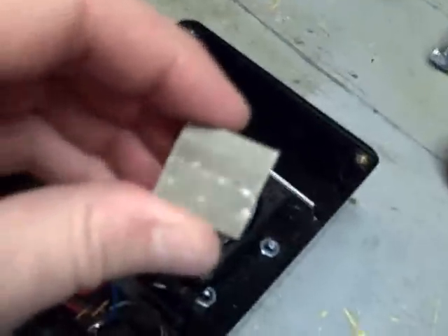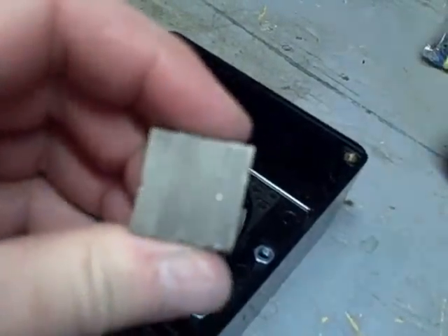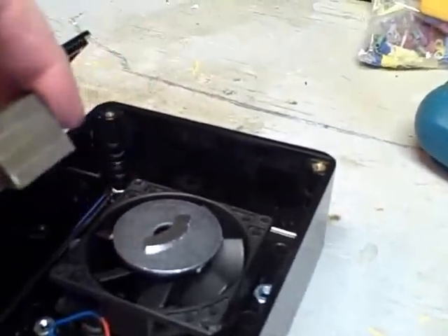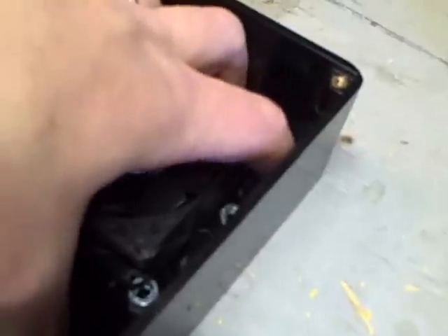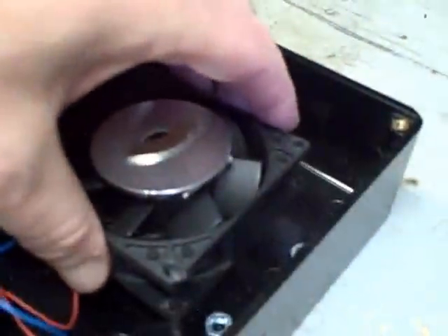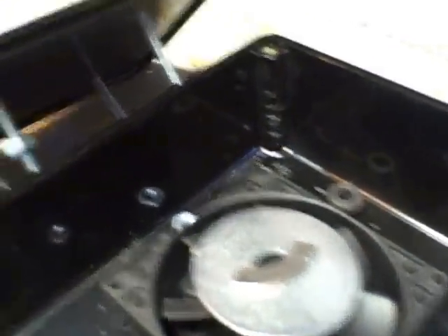I scored some rare earth magnets from work — there are four of them and they are super duper strong. I was going to end up using one on each side if the hard drive magnet didn't work, but I believe it's going to work. Some people mount their fan to the bottom or use a metal plate with spacers to raise the fan up. I went the opposite way and mounted my fan to the bottom of the lid.